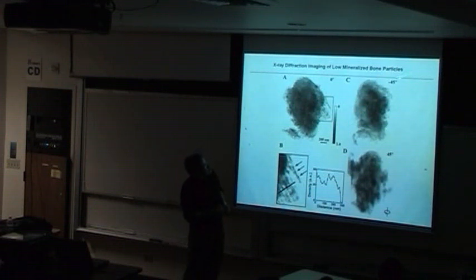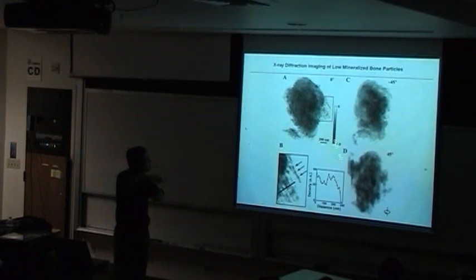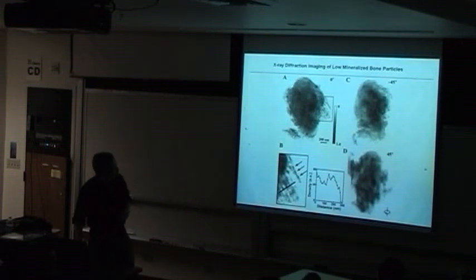Now, if we rotate this at different angles, this actually disappeared. So it's not always in one orientation. It seems the orientation inside the fiber is not always in the same direction; it depends on which direction you look at it.